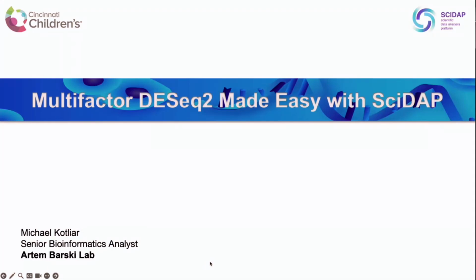Differential expression analysis. How to do multi-factor differential expression analysis on SciDAP in an easy way.